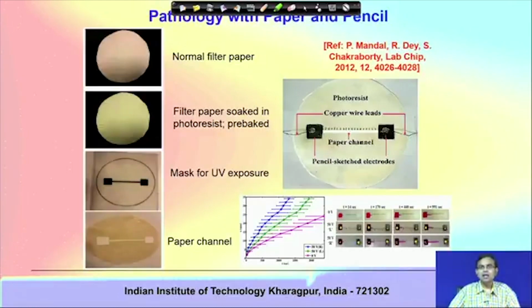So, this can be a low cost platform at its best, and the good thing is that research facilities which do not have advanced fabrication for microfluidics, like advanced microfabrication labs, or research labs which do not have enough money for expensive experimentation or expensive equipment, just by having a printer, paper and a few pencils, you can actually make this technology work.